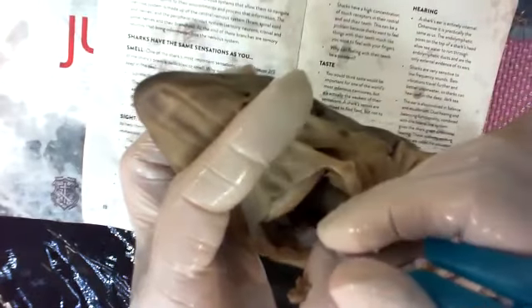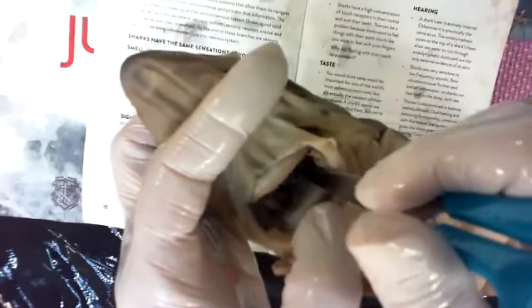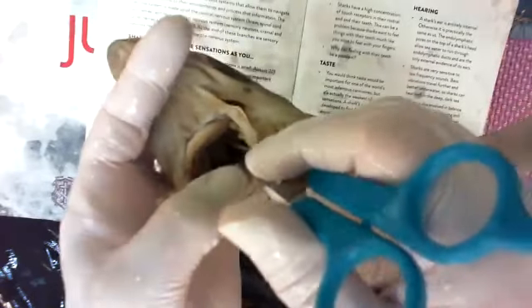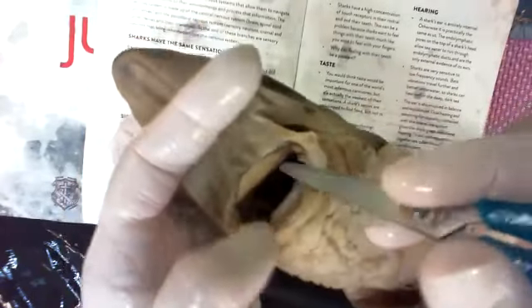So a shark's tongue is really firm. It's actually a slab of cartilage where yours is a slab of muscle. So we use our tongue, we can stick out our tongue, we can curl it into a U shape or circle or whatever for some people. We can do lots of things. A shark's tongue is just really a foundation or like a floor. The taste buds are up here in the roof of the mouth. So a shark bites something and then smashes it against the roof of the mouth. It's like, oh, that's not a Snicker bar, right?